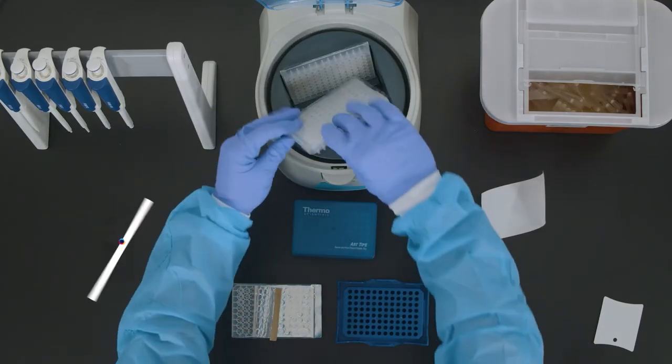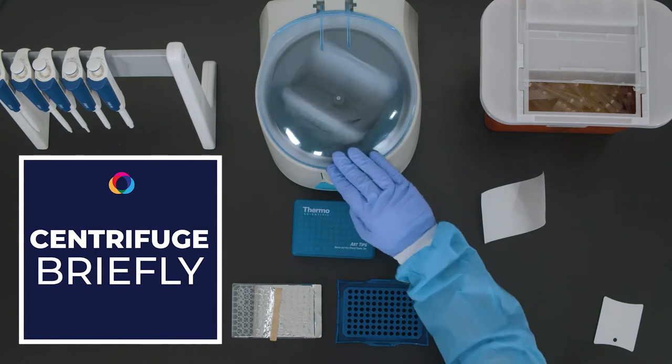Briefly centrifuge the plate. Once the plate has been centrifuged, carefully remove the plate.